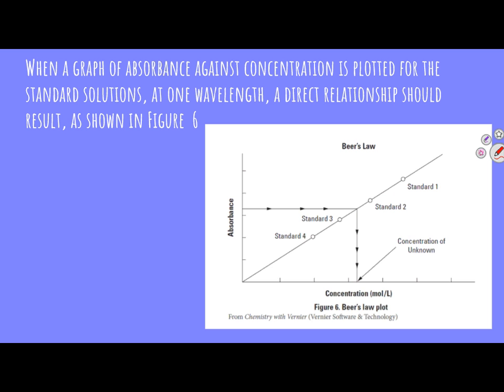So if I have you test any other concentration, if I give you a new unknown concentration and say, find the concentration of this, what are you going to do? Find the absorption how? On the spec, and then what? Look at the line you have graphed, your calibration curve.